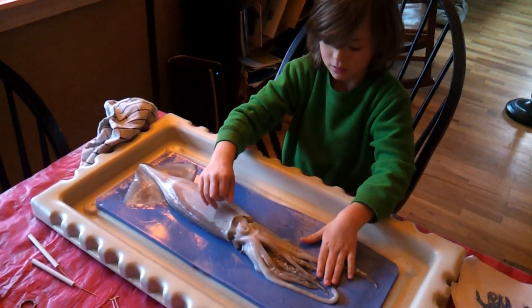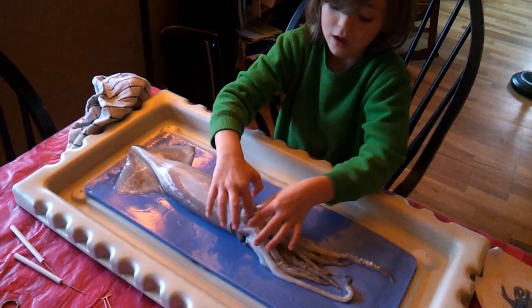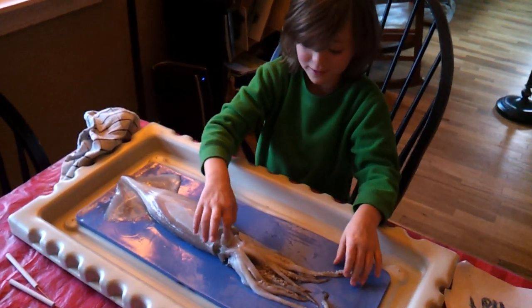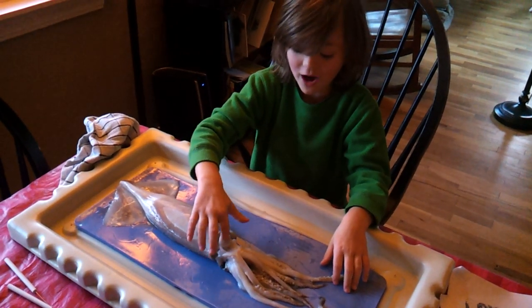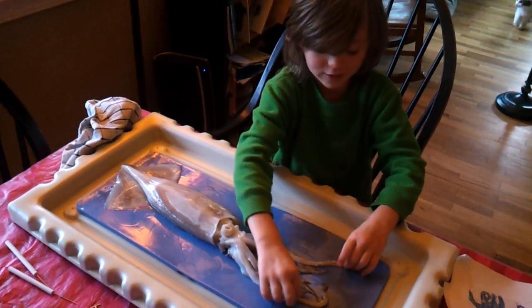Now what's that hole that you just put your finger on? That is the funnel. These are the tentacles.